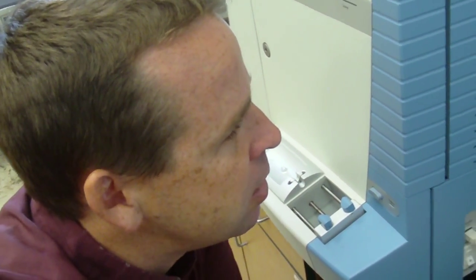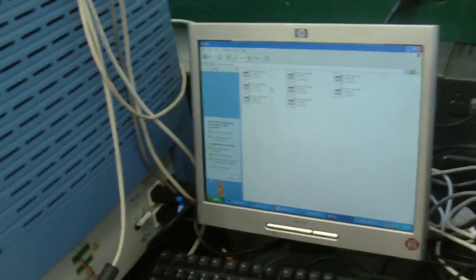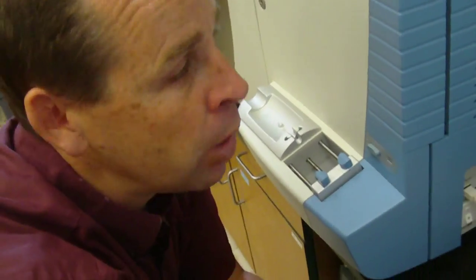You know, I can't really teach that. You just have to kind of look for trends and be aware of what's going on. But yeah, okay? Does that make sense? So 11 out of 20, and then there's a third page here, obviously. Go and look for some data as well. Okay, so we've done 2 of the 8, right? If I remember right, there were 8 cuts here, right? So you want to go through all 8 and then put that all in one list, and this person had diabetes or whatever, and look at that sample. Does that make sense? And then after we get all those samples, we will analyze the data further. Okay. Does that make sense? Yes. All right. Great.